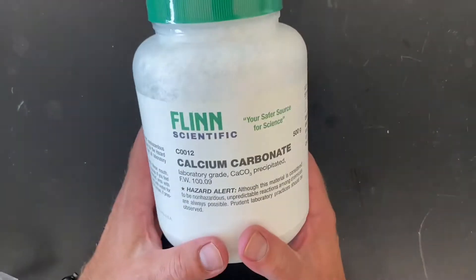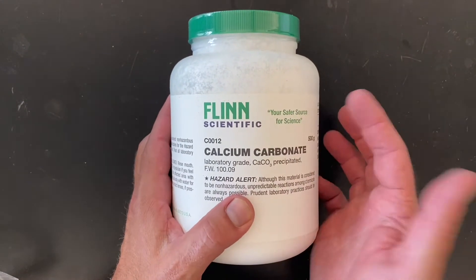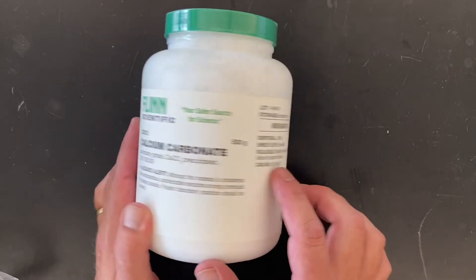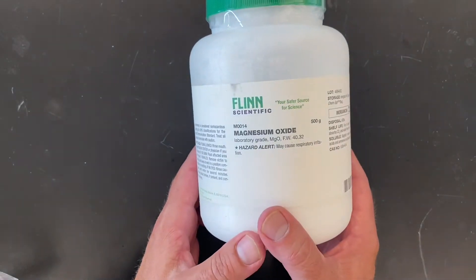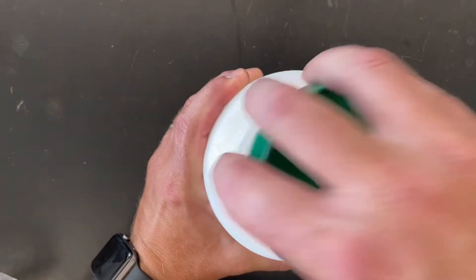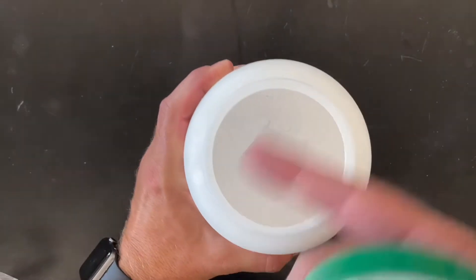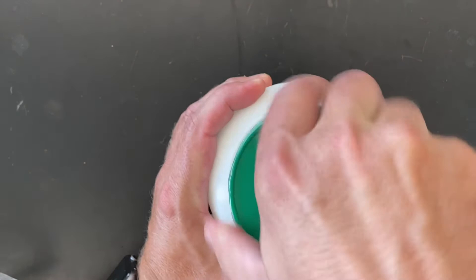Also in this package we have some calcium carbonate, which is finely white powdered — basically it's chalk. It's about 100 grams per mole and this is a 500 gram bottle; we got three of those. Some magnesium oxide as well — another white powder. This powder tends to get everywhere all over the lab; you can see there's like powdery smoke coming out. We got three bottles of that.